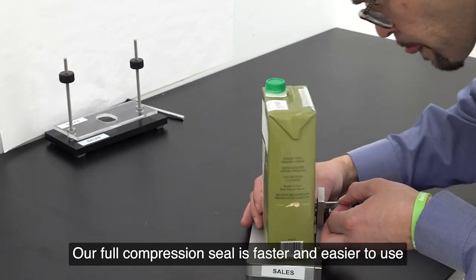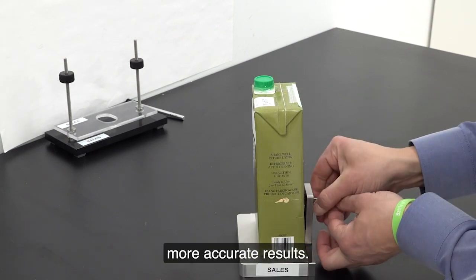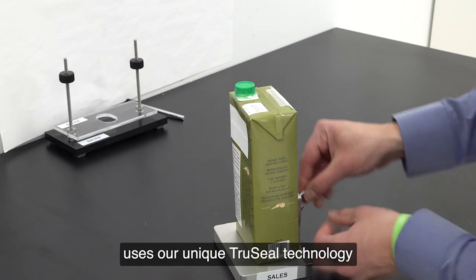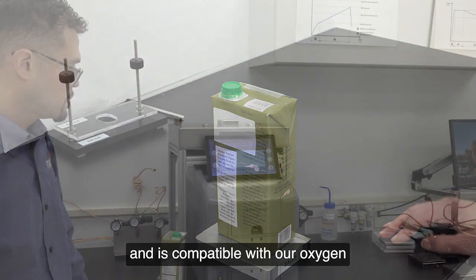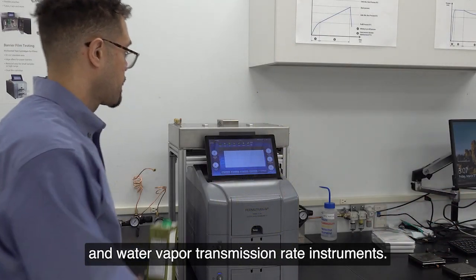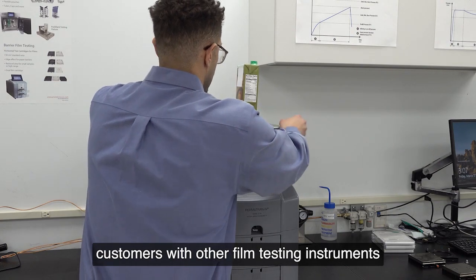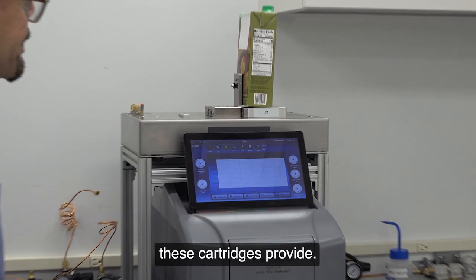Our full compression seal is faster and easier to use while providing more repeatable, more accurate results. Our carton testing cartridge uses our unique TruSeal technology and is compatible with our oxygen and water vapor transmission rate instruments. With the pack rack accessory, customers with other film testing instruments can also benefit from the ease of use these cartridges provide.